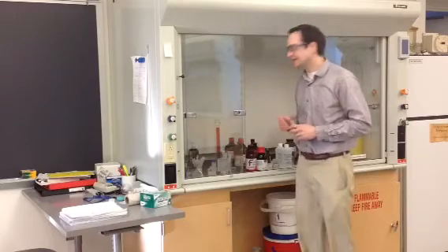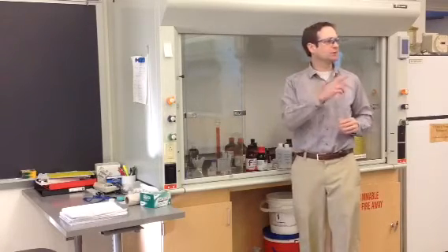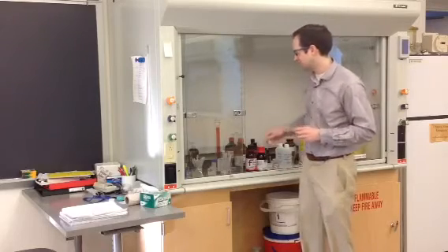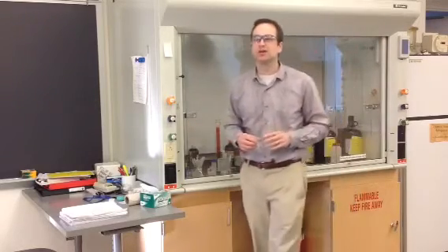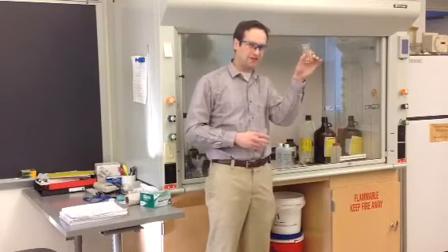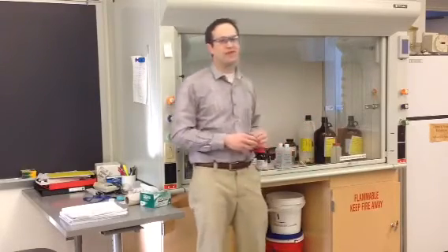The alcohols do not have nearly that bad of a smell, so they're going to be located throughout the lab, usually in an open space. So again, measure those out in the exact same way that you measured out the carboxylic acid, but you don't have the same issues associated with the smell. Once you get those 2 things together, you're then going to add in your mineral acid. We've got concentrated sulfuric acid that you'll be adding in. Measure that out with a pipette, put it in, get a reflux condenser on your reaction, get some water tubes going in and out, set the heating mantle to about 2, and then you're going to run your reflux.